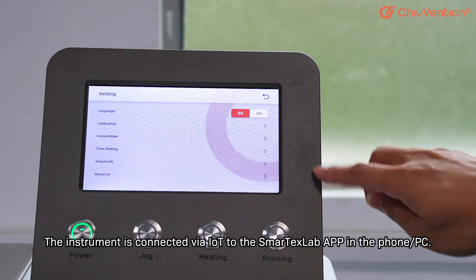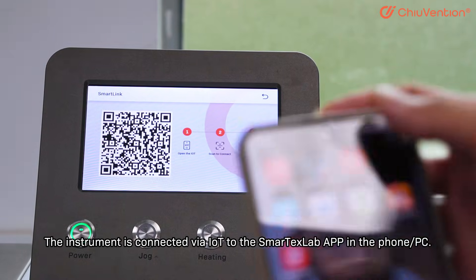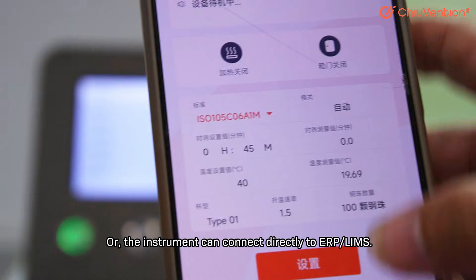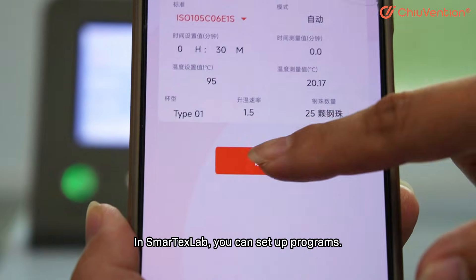The instrument is connected via Wi-Fi to the SmartTagsLab app on a phone or PC, and the app can connect to ERP or LIMS via an API, or the instrument can connect directly to ERP or LIMS. In SmartTagsLab, you can set up programs.